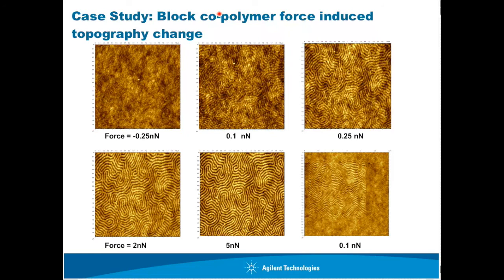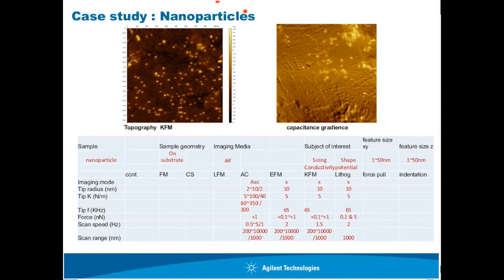The next question: for capacitance measurement of nanoparticles using AFM, what is the principle? I am curious how it works. That's slide number 31. Again, this is also covered in one of the early presentations. It's called Beyond Tapping mode. You can again find it on that eSeminar download, and again, we could talk about it if you email me.